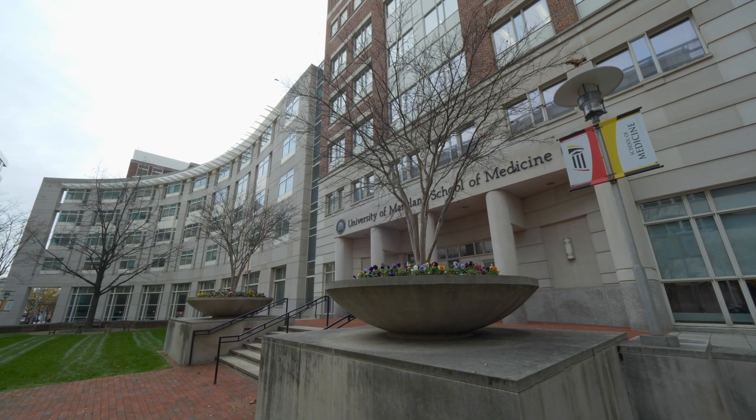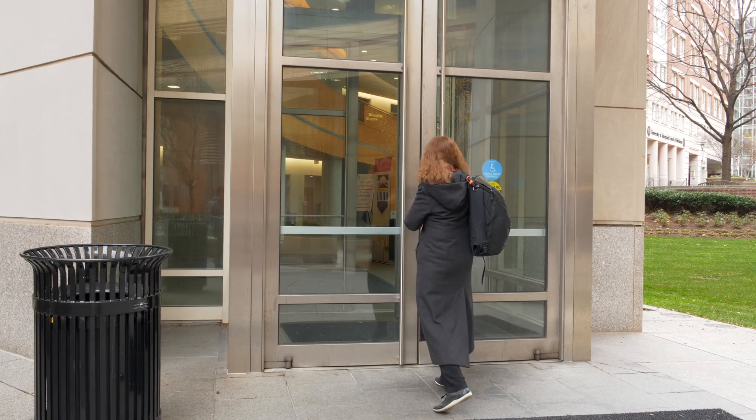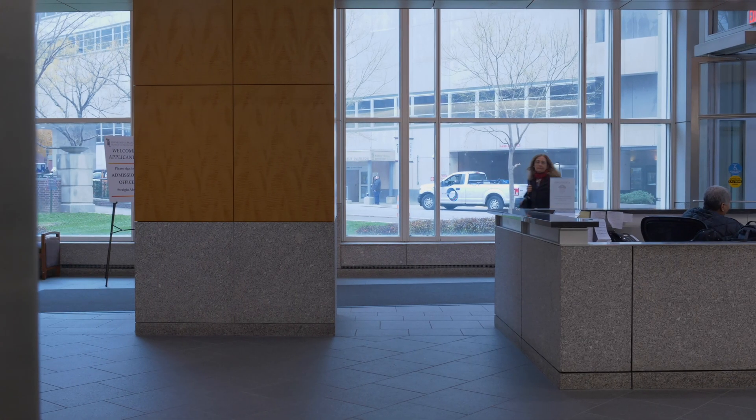I study Alzheimer's and Parkinson's disease in this department. What I have found over the years as money has become tighter is that I need to really make each person as productive as possible. So I've invested heavily in labor-saving devices.